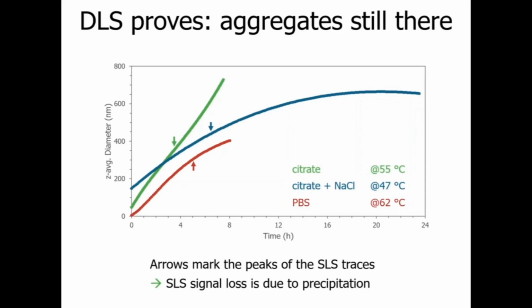So in summary, monitoring the static light scattering and the dynamic light scattering signal in the accelerated storage test adds important insights to what we know from the ramp. What I want to point out here is also that DLS data is susceptible to number fluctuations, especially when you're following aggregation. So what we're looking at here is not the DLS raw data, but a fit to it.